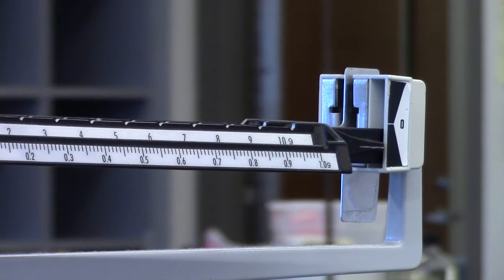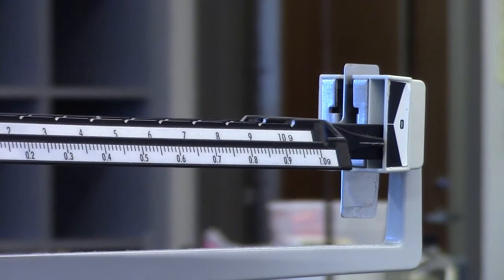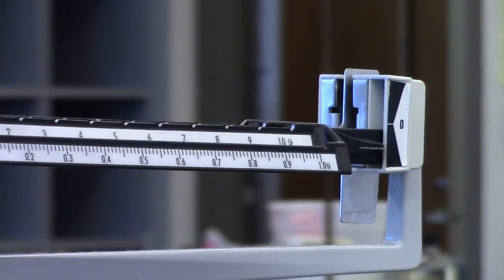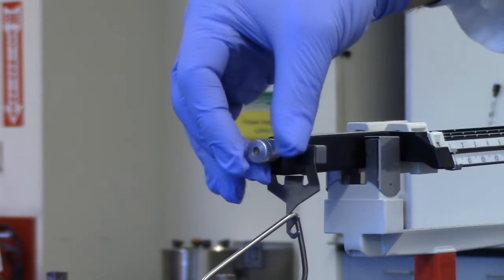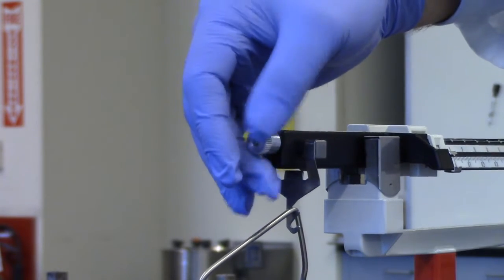Next, the balance must be zeroed. If the pointer is below the zero, it means there is too much mass on the beam, so turn the screw away from you.